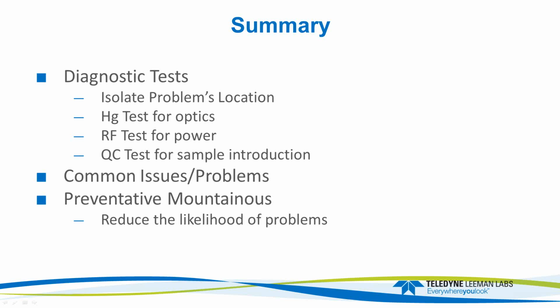Okay, first question is, if you have a dual view system, how do you know the best view to pick? Also, how do you know the best wavelength to pick? And what criteria are you looking for?